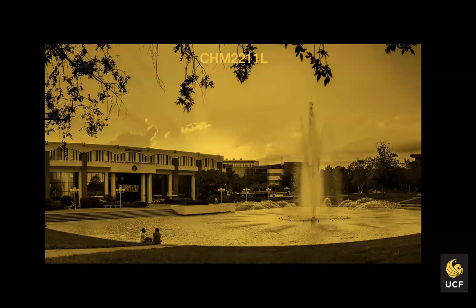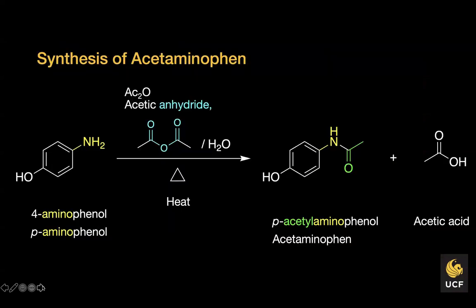Okay, and just to clarify, there was nothing that we needed to know about a theoretical mass, right? I will go over that. That is a calculation that you'll have to do. You'll need it to calculate percent yield. Okay. What you need to Google is theoretical melting point. What is the actual melting point of acetaminophen, right? You should get 169 degrees Celsius.